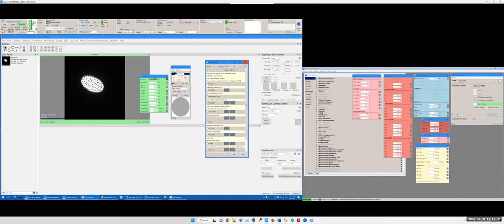So now let's say, normally we don't need to worry about MC1QX. You can see it's blinking to a sharp line. That's a good condition for MC1QX. And then we click this MC11QX. When you click this round icon, it just wobbles. What is being changed? The MC11QX element is being changed in an up and down fashion. So when they change this, the aperture is moving up and down. Do you see that this aperture is moving up and down?